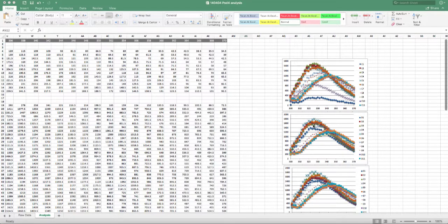And then we're going to take that 324 and divide it by the fluorescence value at 340, which again approximates this place where the curves all cross each other. Now, if you look at the curves, you can see that for folded protein, this ratio of 324 over 340 should give you a value that's greater than 1. Whereas if we look at an unfolded curve, like this one over here, the ratio of 324 over 340 should give a value that's less than 1. And so we're going to use the change in this ratio to measure the shift from folded to unfolded protein.